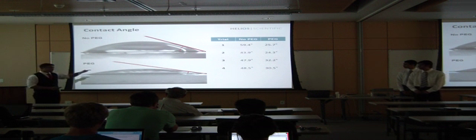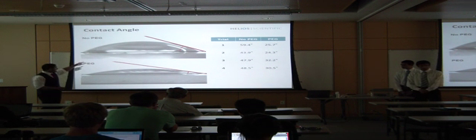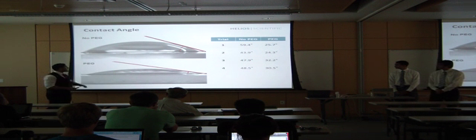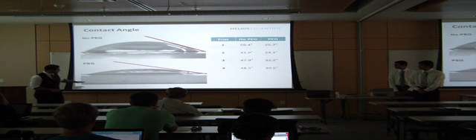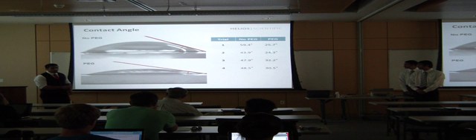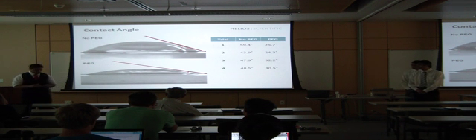In addition, PEG will interact very, very well with water. And as you can see from these slides, the top one is no PEG. These are measurements of contact angles with our glass shield. This shield has not been treated with PEG. The contact angle, as you can see, is very, very high. The bottom one is a glass slide treated with PEG. The contact angles are a lot lower, meaning that the water droplet on this glass slide is interacting with the surface.